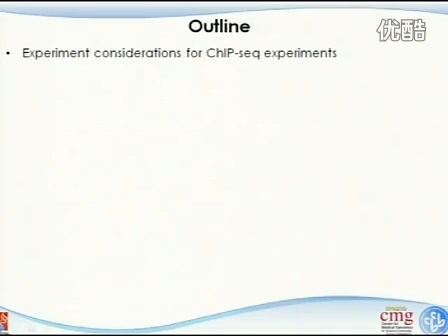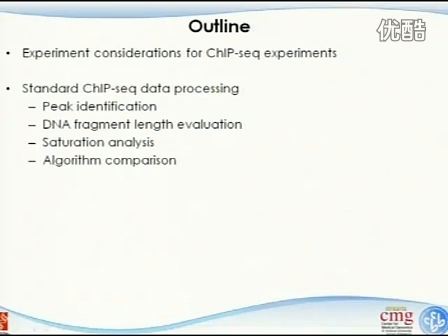Today, we will get into the data analysis part. So we'll first give a very brief introduction of experimental considerations for the ChIP-seq experiment. So before you do the experiment, what do you think about that? What considerations do you want to have?